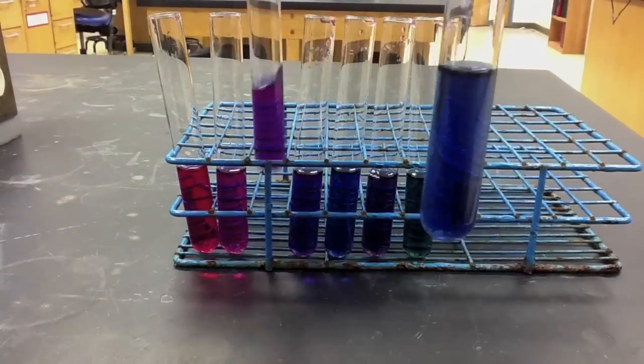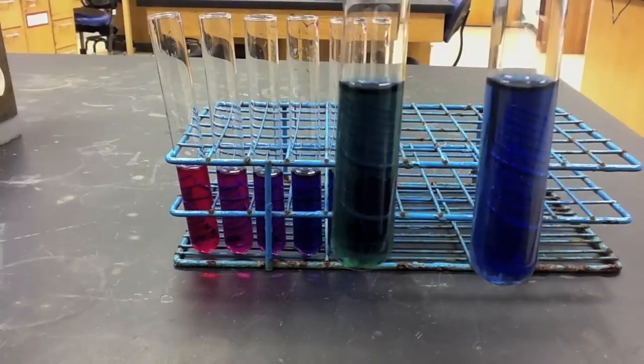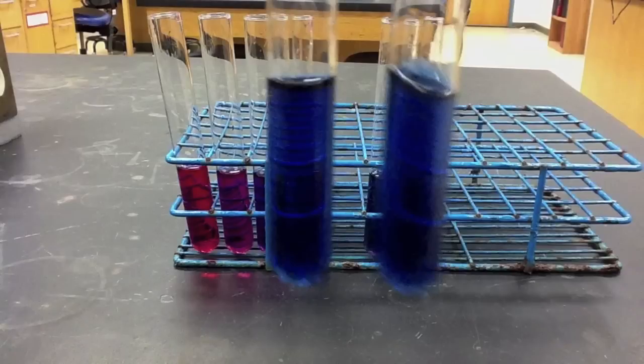As can be seen by comparing the unknown solution to each of the different buffers, pH of 8 is the correct pH for my unknown sample.